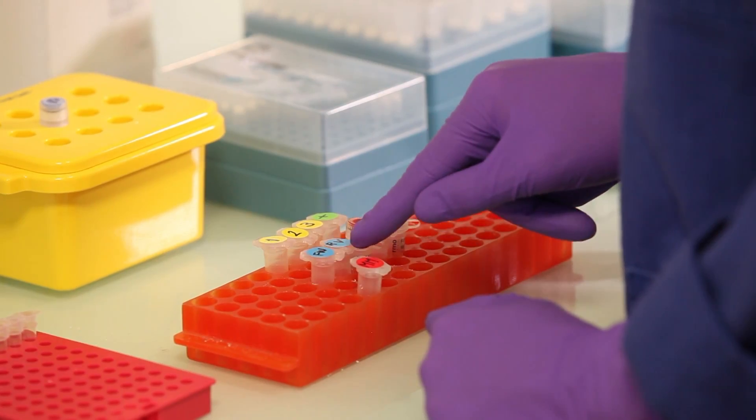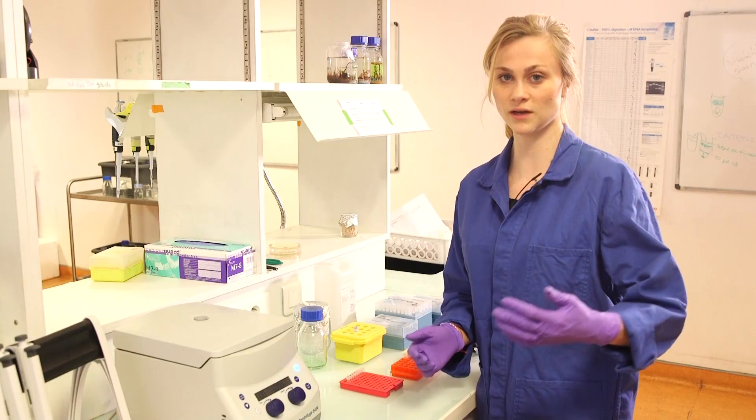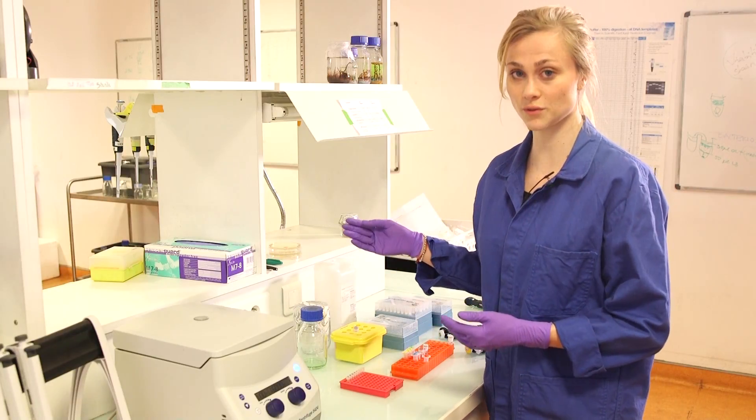We have our forward primer and our reverse primer. The forward primer will anneal to a part in the DNA just before the gene, and the reverse primer will anneal to a part downstream of the gene. And of course we need an enzyme to polymerize our DNA fragments.